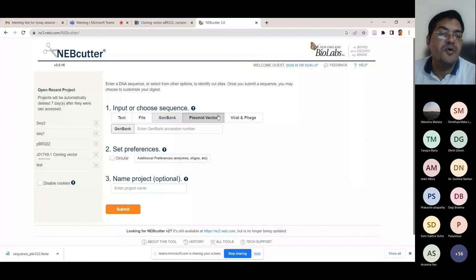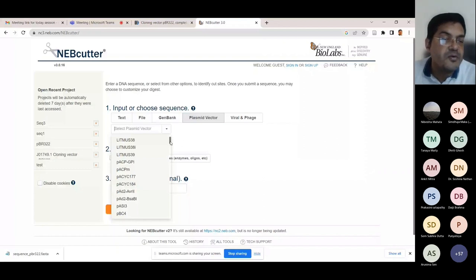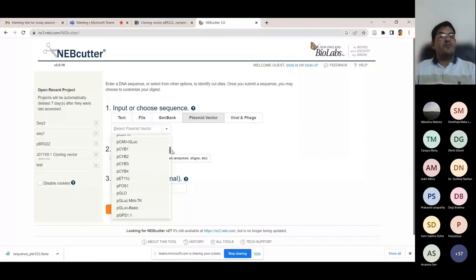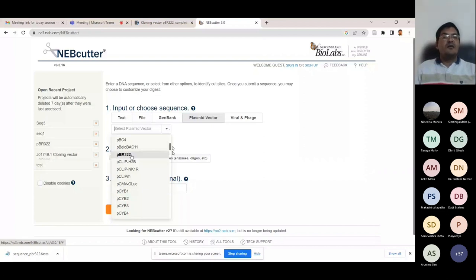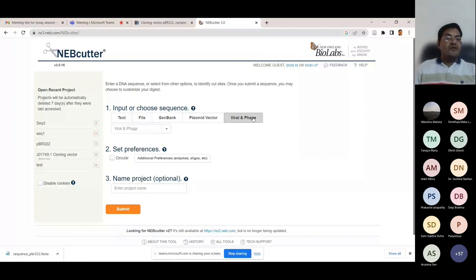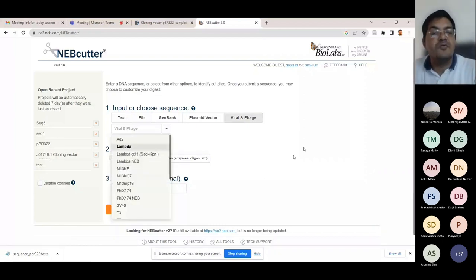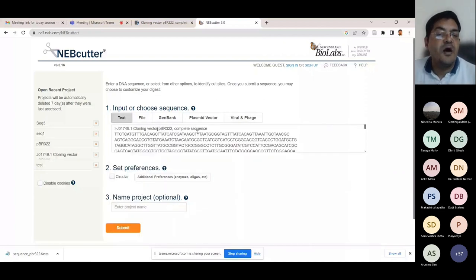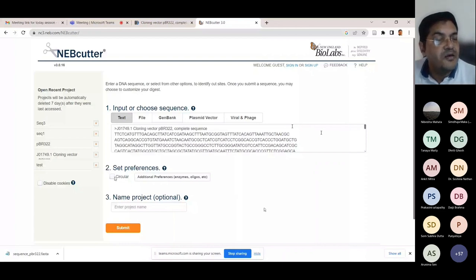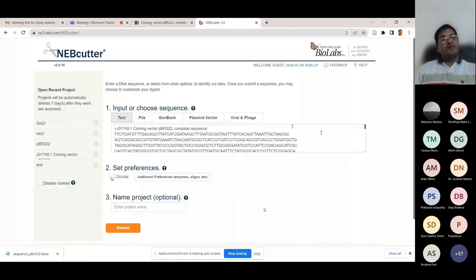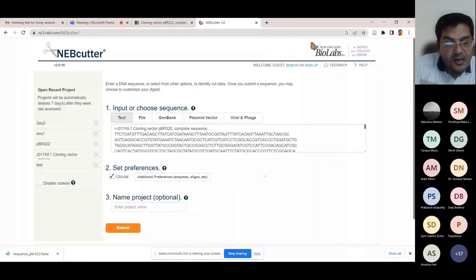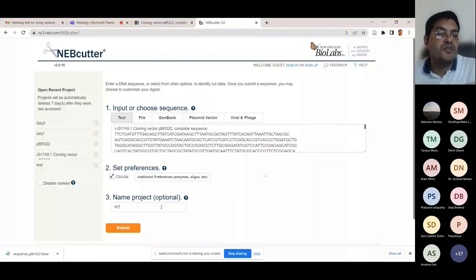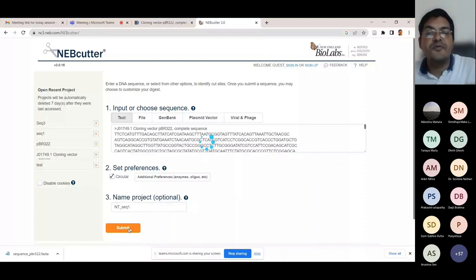After pasting the pBR322 sequence, set preferences to 'circular' since this is a plasmid. Optionally name the project. When you submit, NEB Cutter generates a restriction map showing all enzymes that cut once into the sequence. Mousing over an enzyme name reveals the recognition sequence, cut position on the top and bottom strands, and whether it produces a blunt or staggered cut.